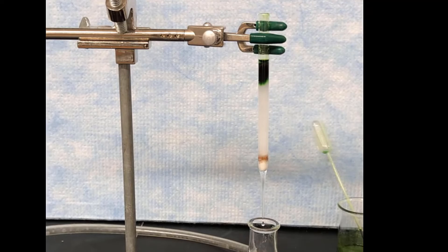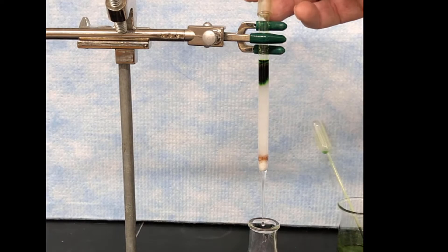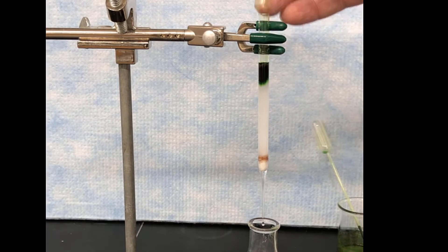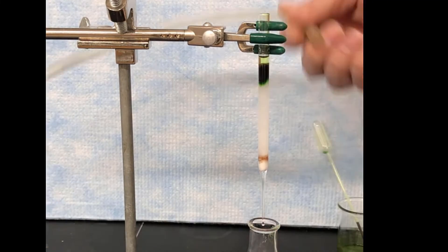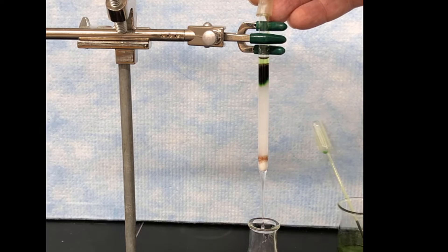Next we're going to add a bit of hexane to the top, and that is going to help chase the pigments out of the sand layer and get them seeded onto the silica gel. That's the purpose of that. I'm going to do just a little more there to get the green pigments all adsorbed onto the silica gel.